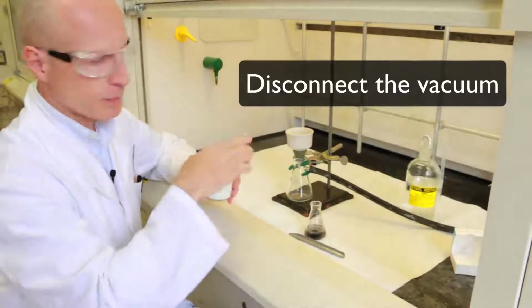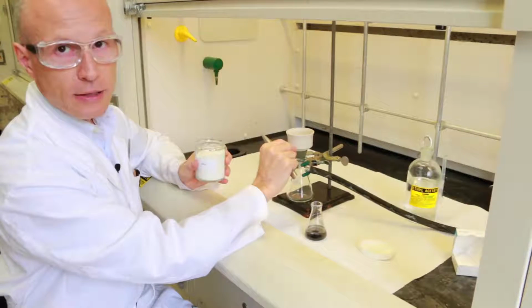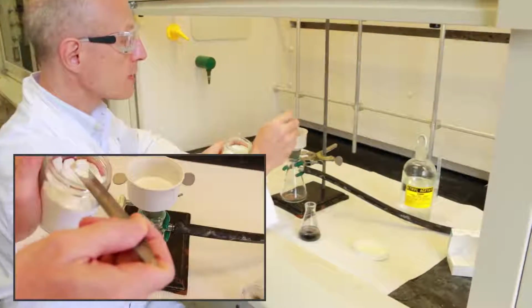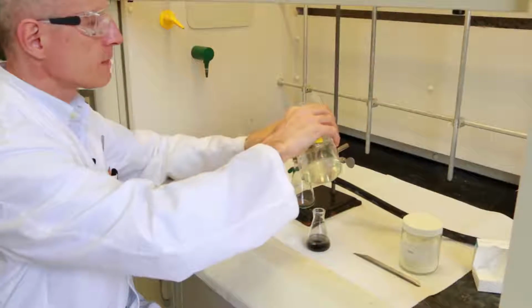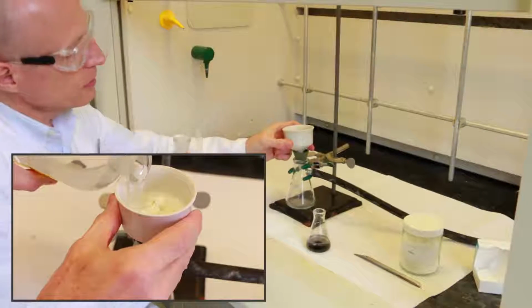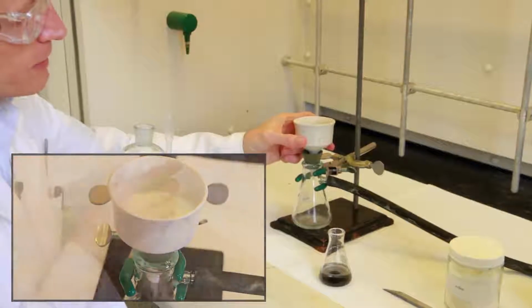You break the vacuum and you add a little bit of Celite. You just need a couple of millimeters thick layer at the bottom of the funnel. So a couple of spatulafuls are going to be more than enough. Then you add some ethyl acetate. Notice that there's no vacuum applied, and you swirl the funnel around so that you distribute evenly the Celite on the bottom of the funnel.